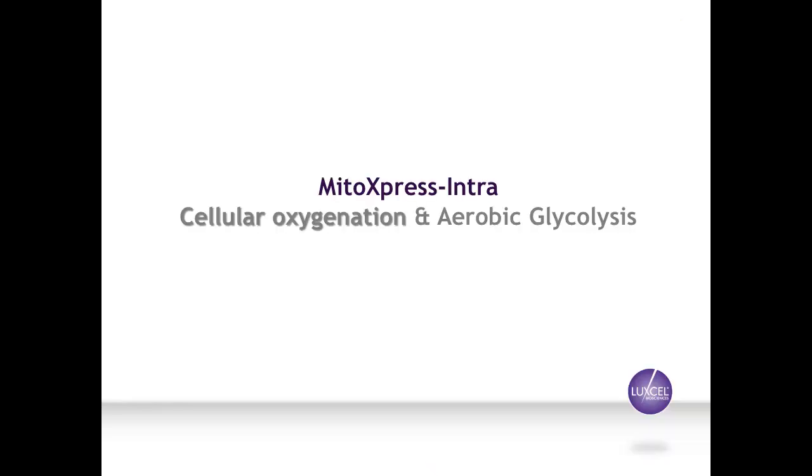So moving from that to the assessment of cellular oxygen consumption and aerobic glycolysis, we've spoken about using 3D maybe to increase the biological relevance of in vitro cell models. People use that. We've just taken a look at what is the relevant glucose concentration, and maybe beyond that, what's the relevant substrate? Should we be using glutamine? Should we be using fatty acids? But an often overlooked parameter when assessing the biological relevance of an in vitro model is the oxygen concentration that should be used for the analysis.